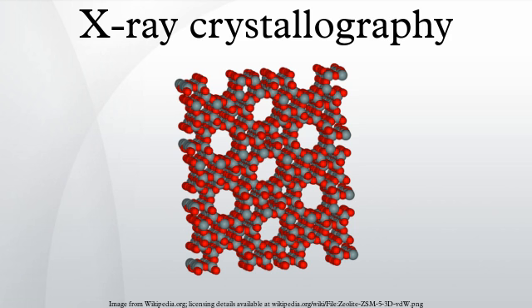Synchrotron radiation. Synchrotron radiation is one of the brightest lights on Earth. It is the single most powerful tool available to X-ray crystallographers. It is made of X-ray beams generated in large machines called synchrotrons. These machines accelerate electrically charged particles, often electrons, to nearly the speed of light, then whip them around a huge, hollow metal ring. Synchrotrons were originally designed for use by high-energy physicists studying subatomic particles and cosmic phenomena.